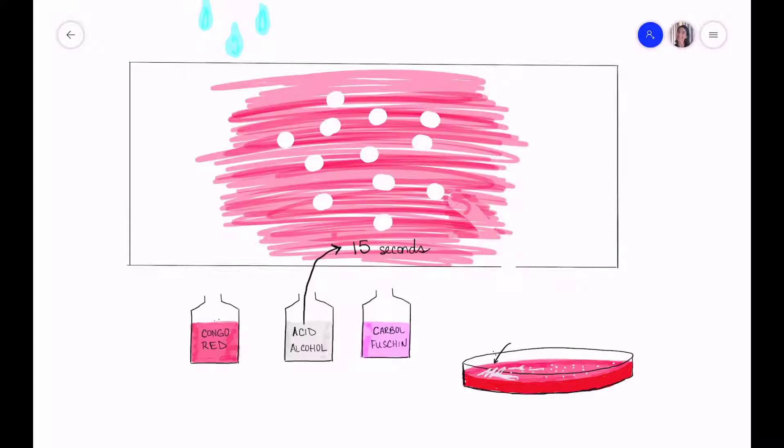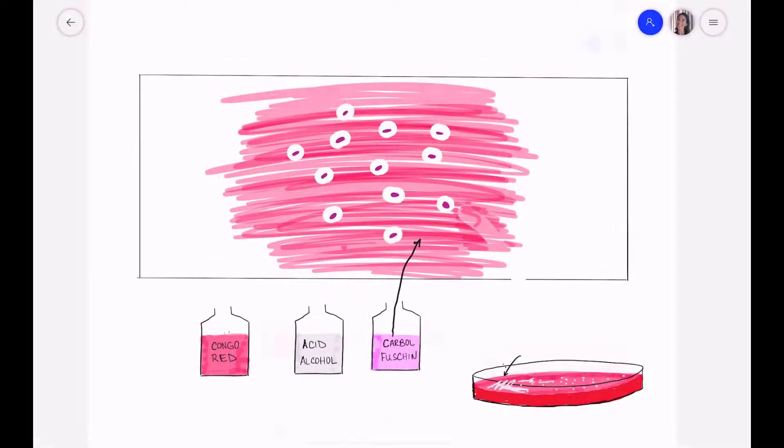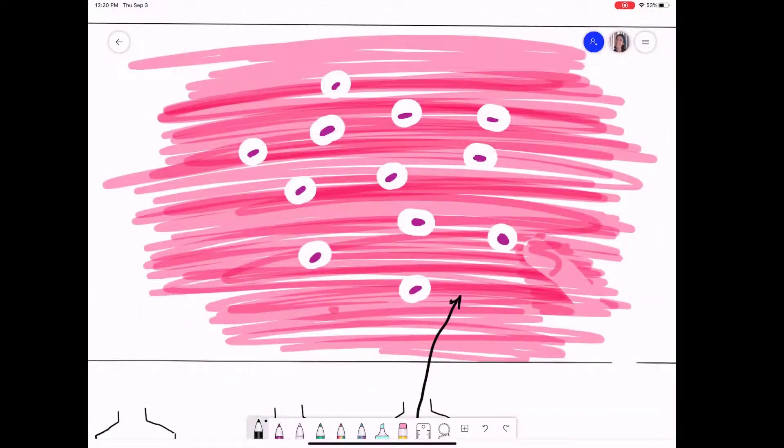Next we're going to apply a counter stain. The counter stain is Carbofusion. Carbofusion will stain the vegetative cells kind of a dark pink. So now what we're going to do is take a look at our slide under a microscope and what we'll see is this.